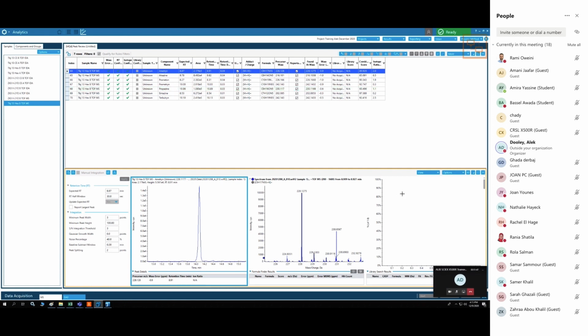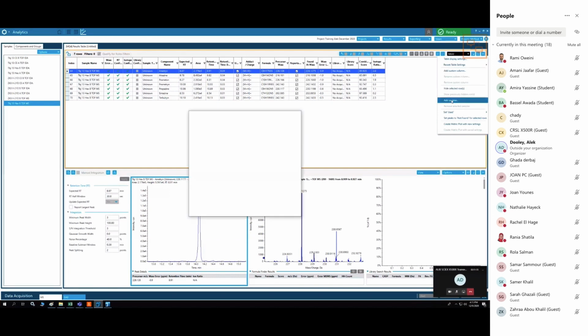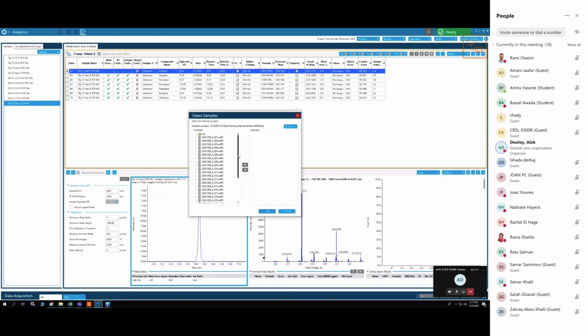A little bit strange. Let's do the same thing with the swath data. I'll just add 2 samples from the swath. Add samples. But we did a very nice column volume calculation, right? So we shouldn't have equilibration problems.